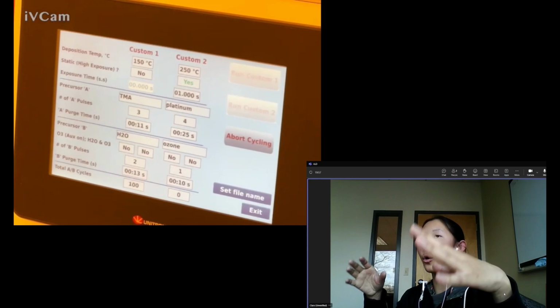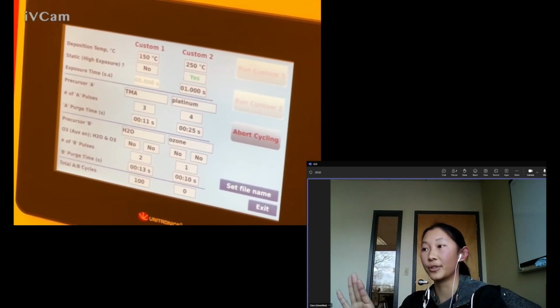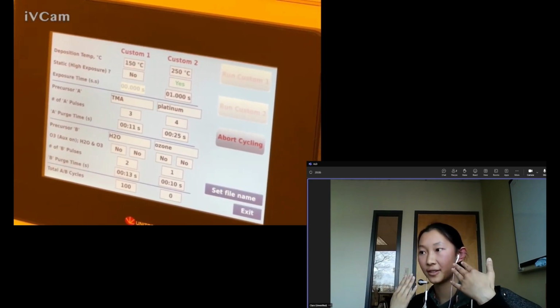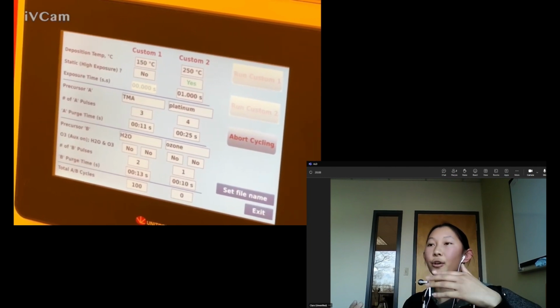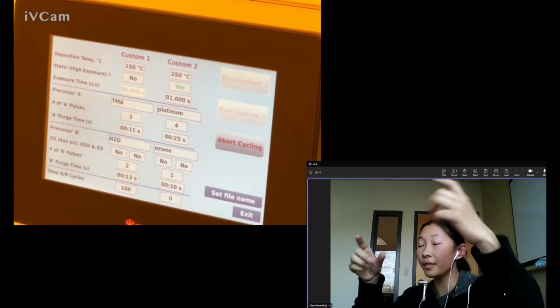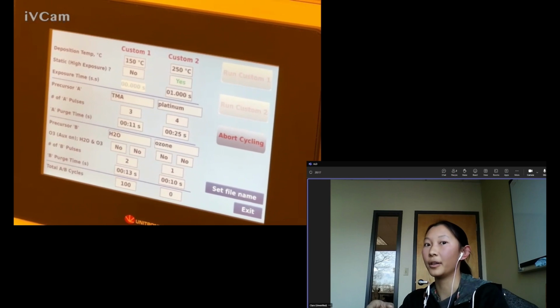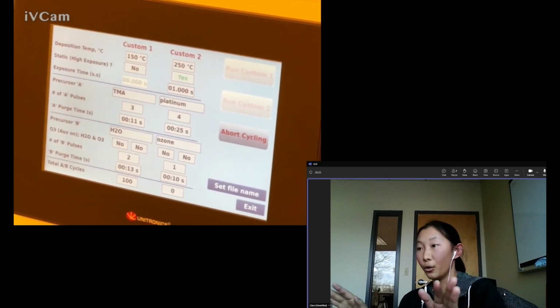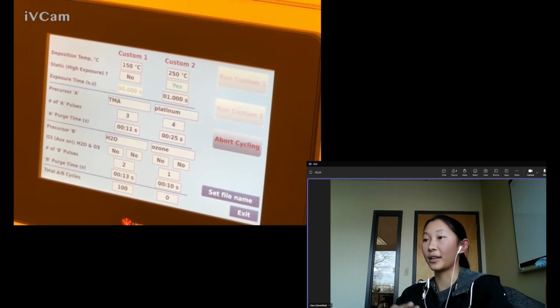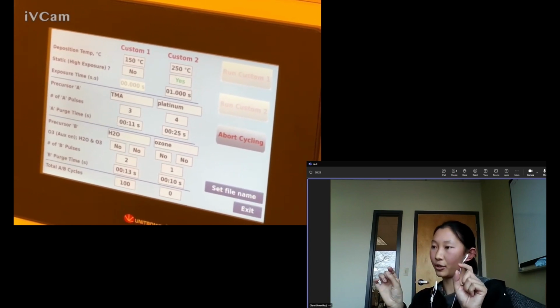The only way for the screen to turn on is for it to be set to ozone. If it's set to oxygen, the screen's not going to turn on. You'll only hear the fans. So you'll have to switch it to ozone, but the power output on the actual cell starts up at 0. If you don't want to be flowing ozone, then the power output will be 0. But if you're running this recipe, you're going to want to set the power output to 100. And there's a little power bar on the bottom that we'll show you.